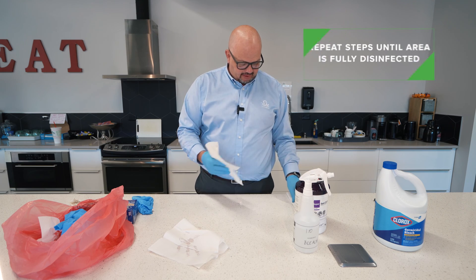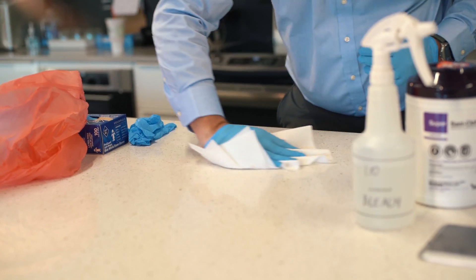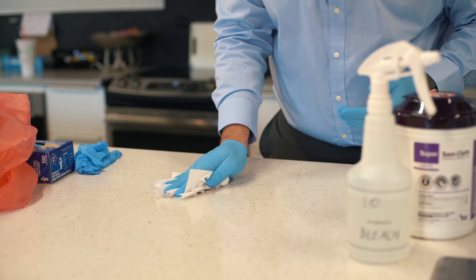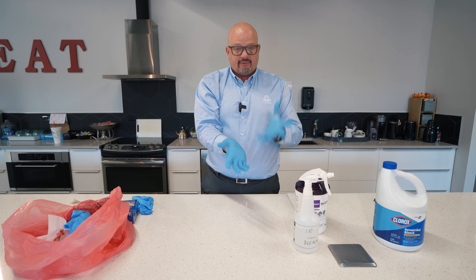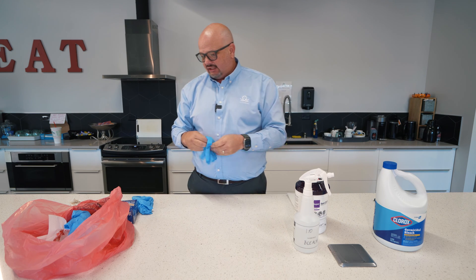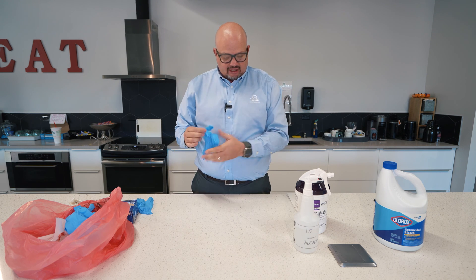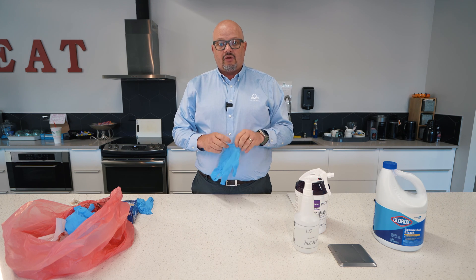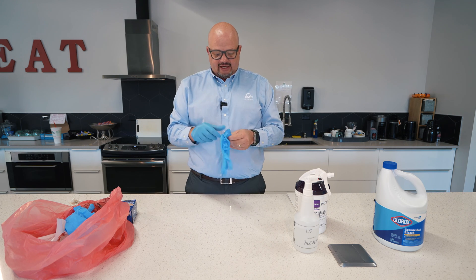After those three minutes pass, I'm going to use paper towels to wipe the surface and place them in the bag. For the last step, I'm going to wipe using a tuberculocidal disinfectant wipe. You don't have to use wipes — you can also just spray the surface and let it air dry — but we have the wipes today so I'll show you how that works.